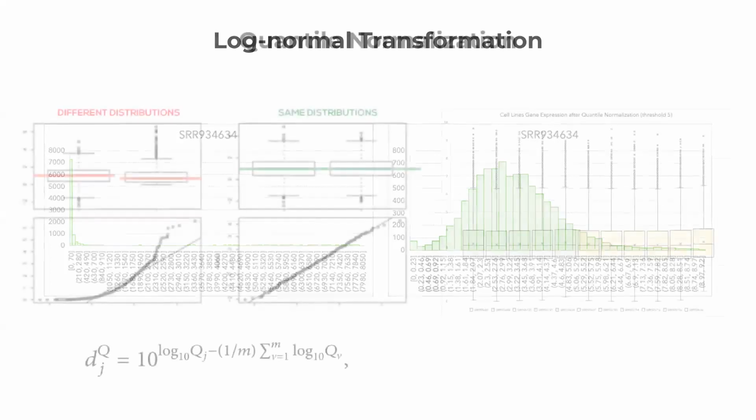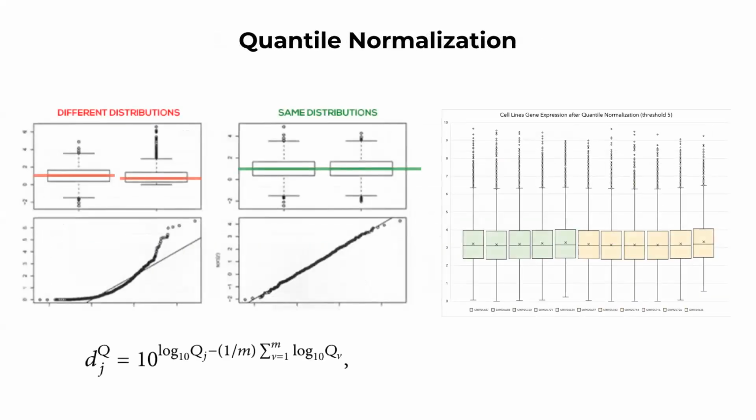Now, another useful way to be able to compare samples between themselves is to really adjust the samples between themselves using noise as a way to normalize the bulk of the data and the mean of the data. So quantile normalization, what it does is it takes the noise between samples and aligns them in such a way that the distribution between samples as well as their means are more aligned.